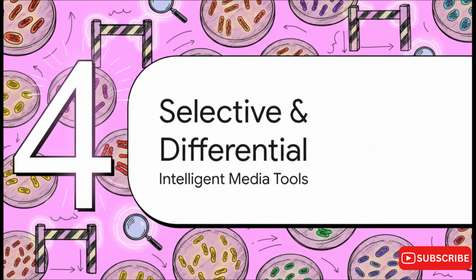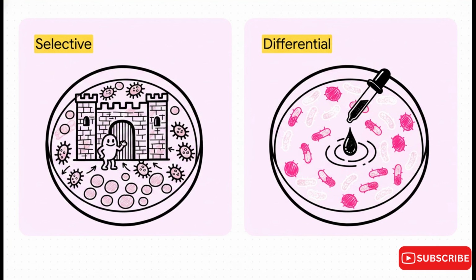All right, Section 4, selective and differential media. Before we dive into the examples, we really need to get the difference between these two concepts straight.